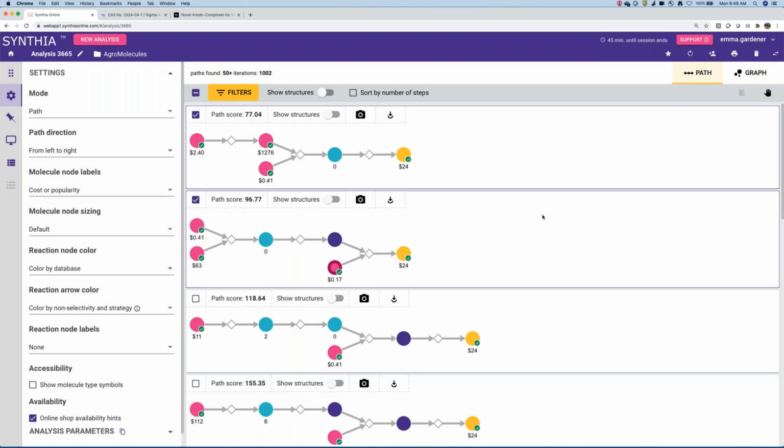And so with that, that is really all of the main features that I wanted to show you with Synthia. So I think we probably have some time now. I'd be happy to answer some questions. Thank you very much, Emma.